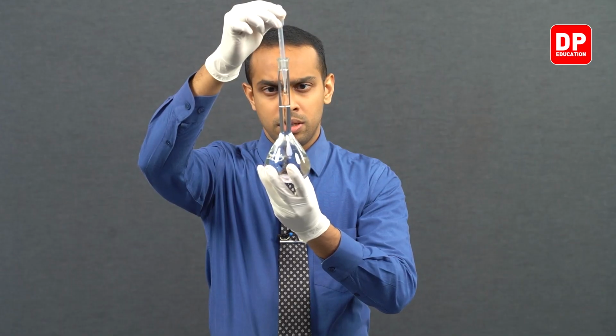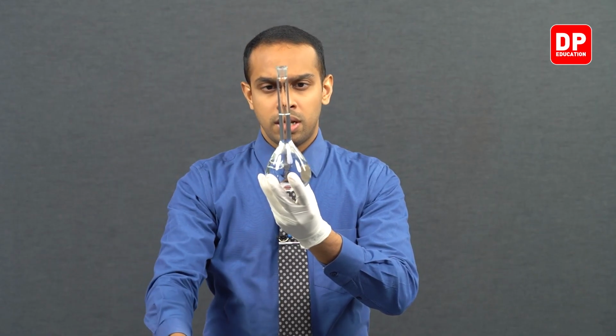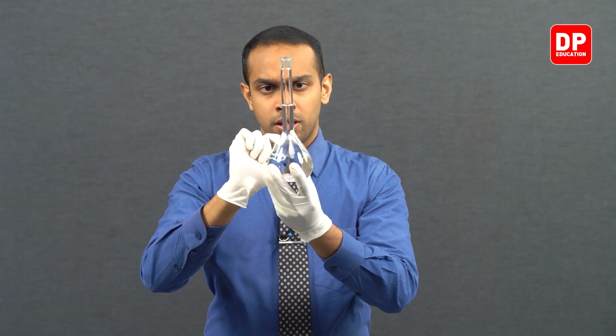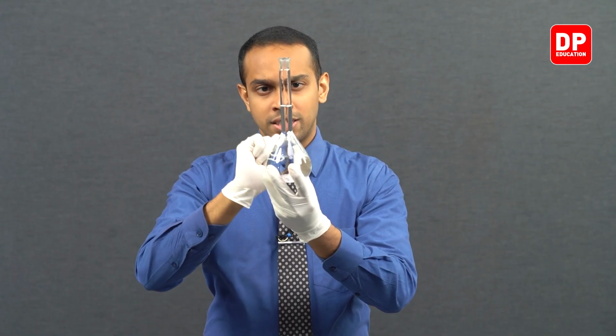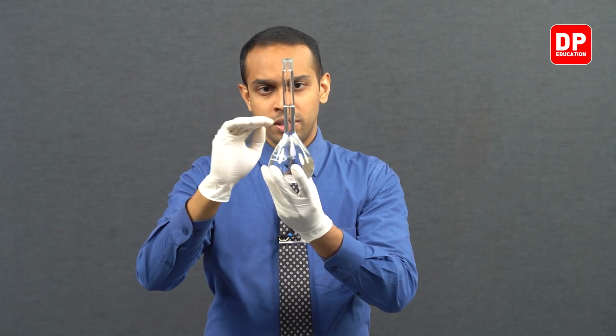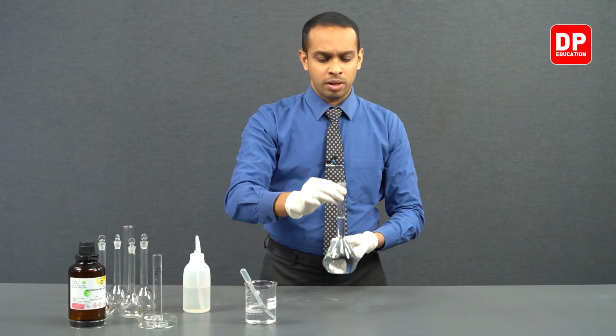As soon as the bottom of the meniscus aligns with the calibration mark, you have to stop adding water, and we can see over here the bottom of the meniscus aligns perfectly with our calibration mark.